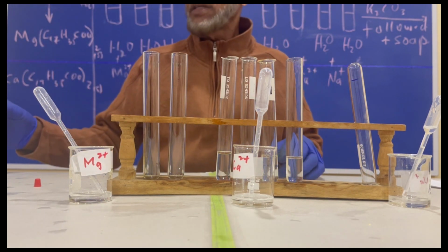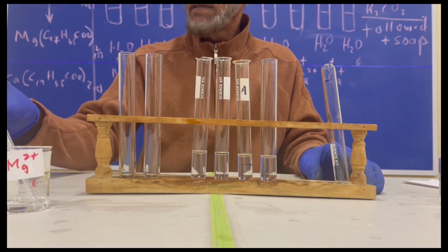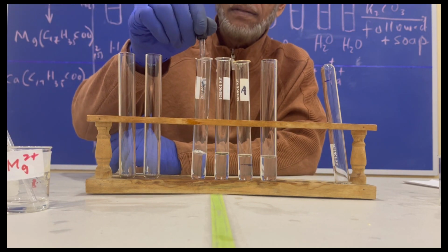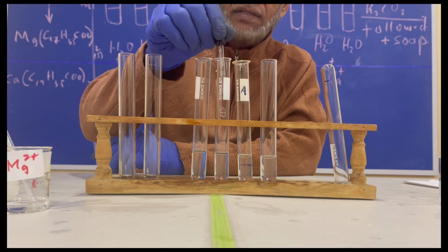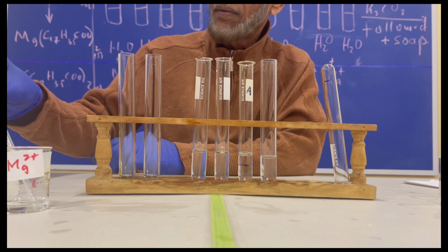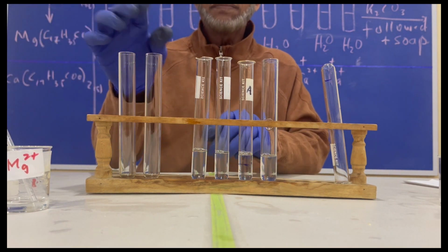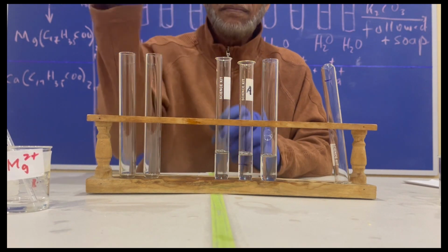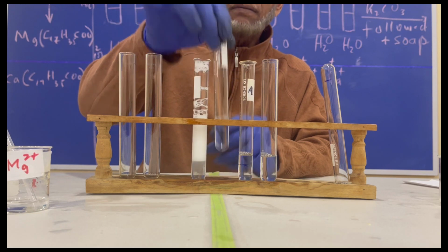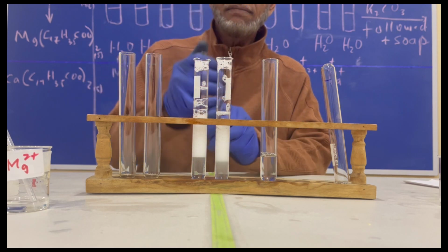Now we'll use detergent molecules, okay? See whether or not we'll get any precipitate form. So we use same amount in each. See if you get any difference in the lathering there. Okay. So now we'll shake each up. You're watching now. Shake this. Lots of lathering there. Nice lathering.